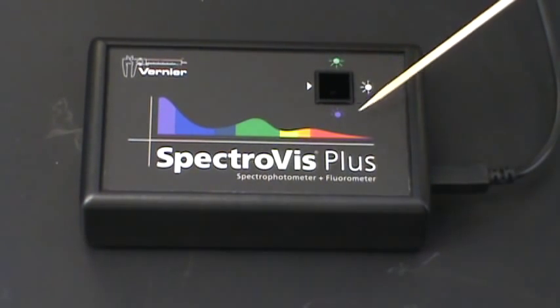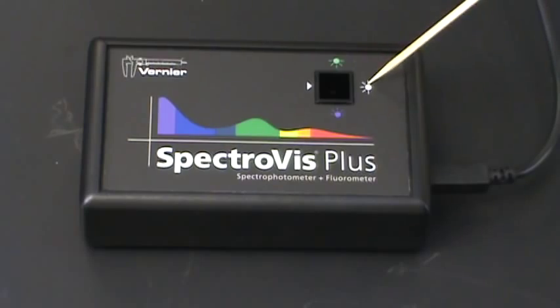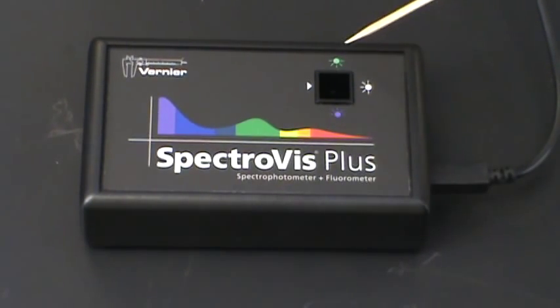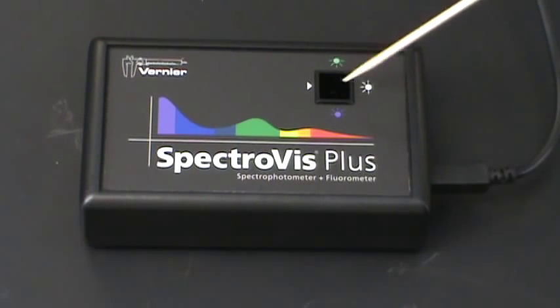The other three sides of our square sample holder each are light sources. Now this particular instrument is capable of doing some fluorescence measurements as well. For fluorescence measurements, you need to shine light in 90 degrees from the detector. So we've got a green light up here, we've got a purple light down here. We're not going to be doing fluorescence right now.